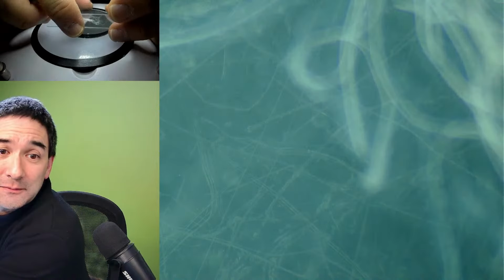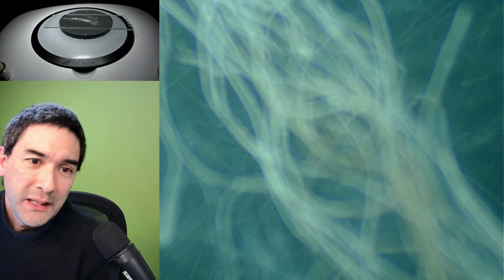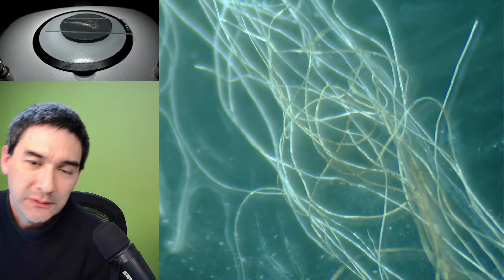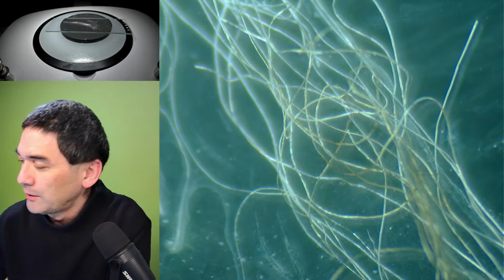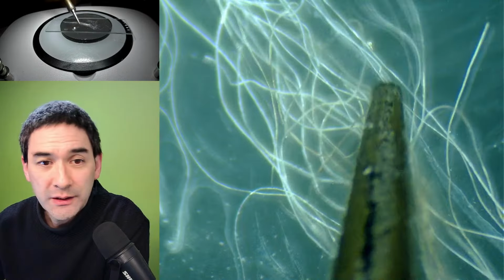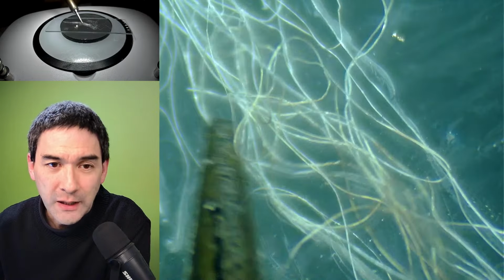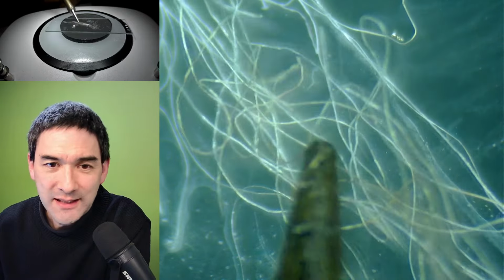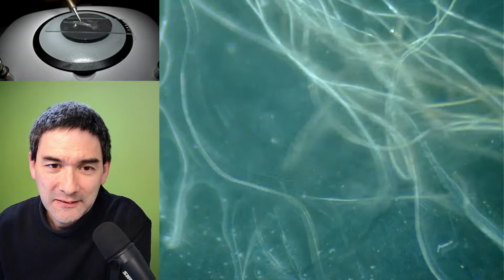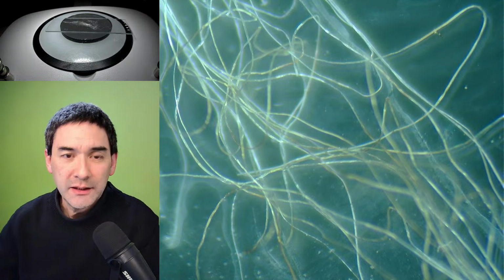So let's do the following. I put a polarizing filter on the bottom, simply to make it a little bit darker. And then you can now see already that it turned a little bit brownish, because I'm frying the cotton here. Hiding in plain sight, that's exactly it. So I think you get the idea, right?